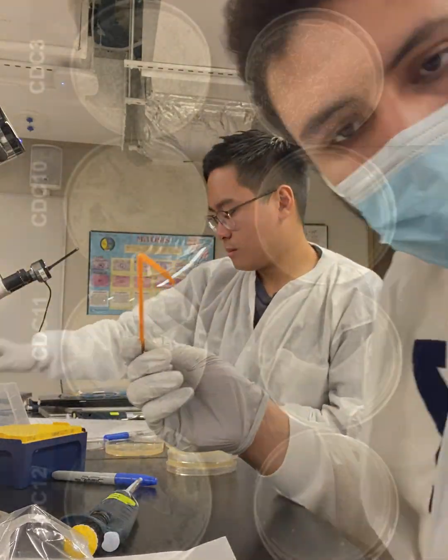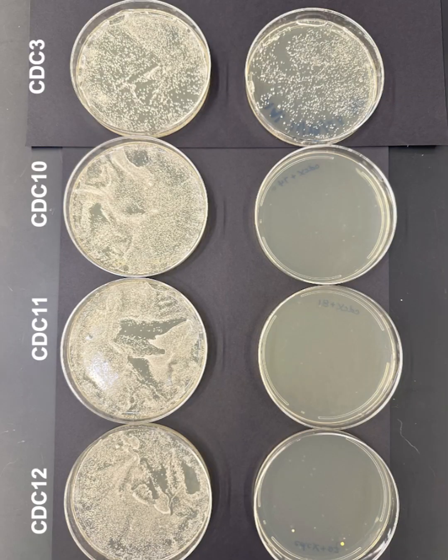And here's what we see. No growth at restrictive temperature for the CDCX cells transformed with CDC11. What a bummer. At least now we know that CDC11 does not rescue our cells, so we can rule out CDC11 as the gene mutated in our CDCX cells.